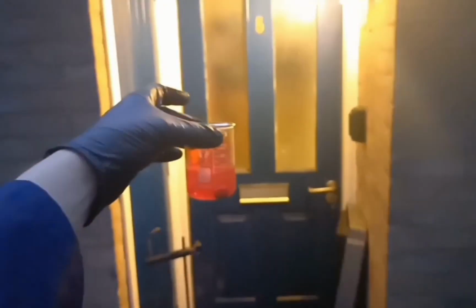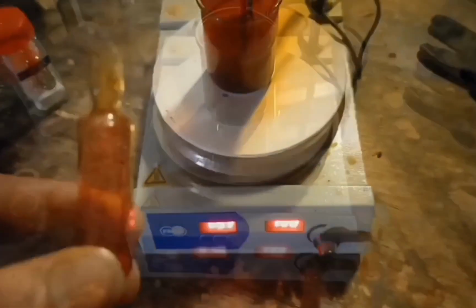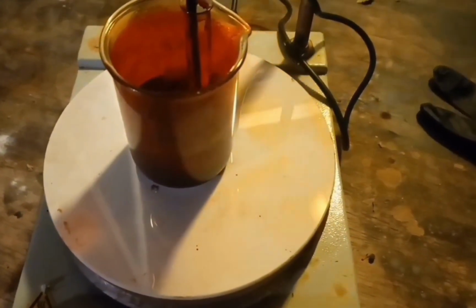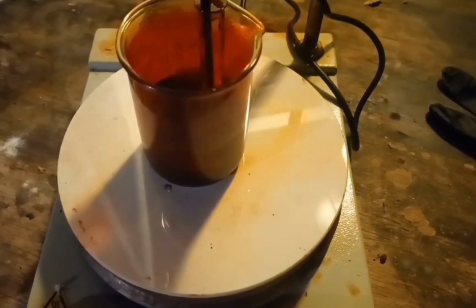Don't breathe the bromine. Bromine's evaporating because it's warm, but it's also reacting.